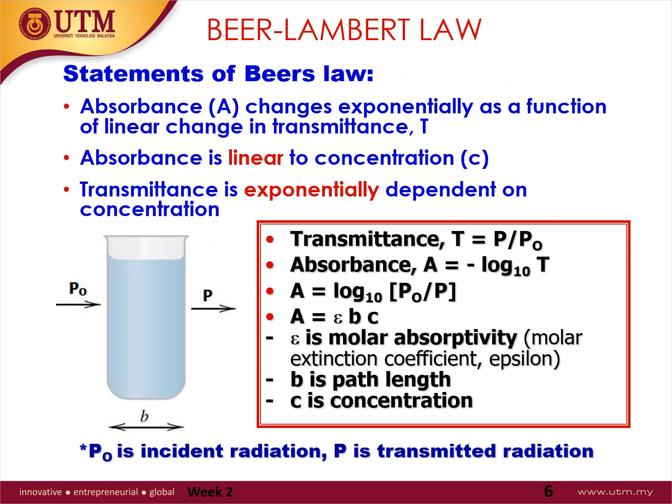Now when you are talking about spectrophotometry, it comes hand in hand with Beer-Lambert's law. What is Beer-Lambert's law? It is simply remembering epsilon b c. Absorbance over here is linear to the molar absorptivity of the species inside your sample cuvette, and also linear with your path length.